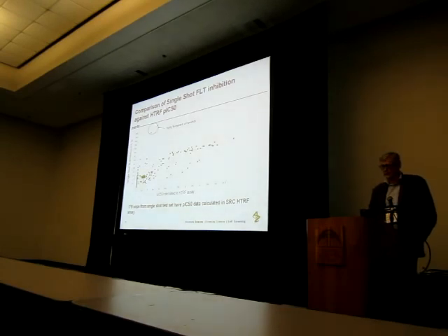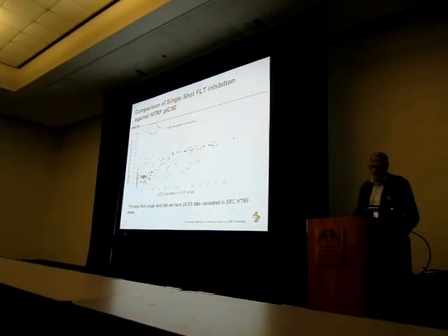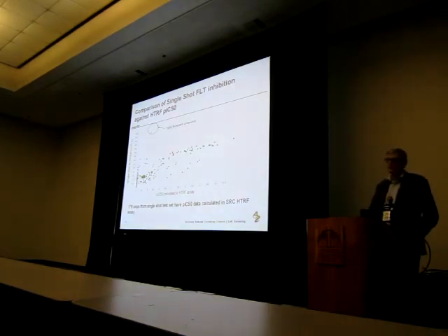So the single shot data that you see presented up the side of the graph there is from the single point percentage inhibition data when these compounds were tested at a single point. Across the bottom, we've got the HTRF assay pIC50 values that were generated, and really the key for us was to look at, at 50% inhibition, what sort of IC50 would you expect to get?